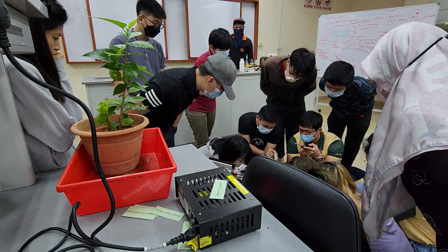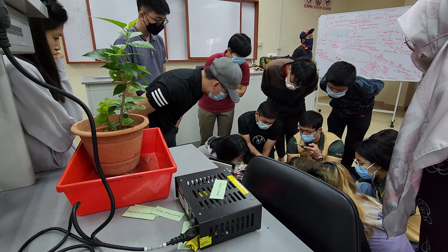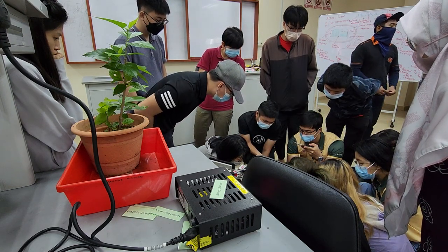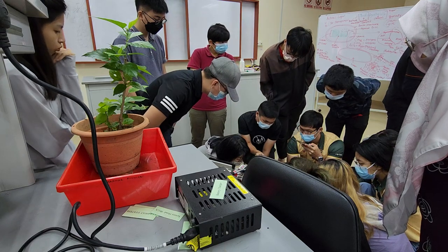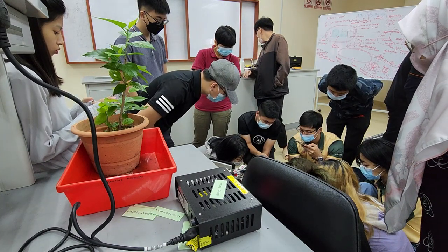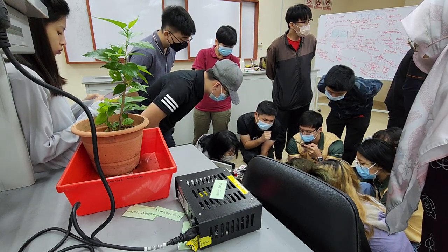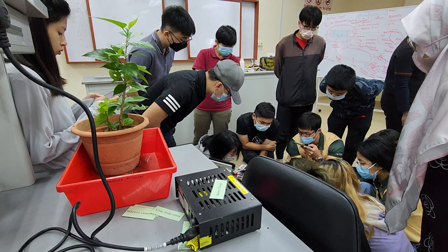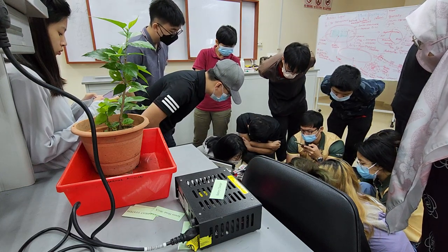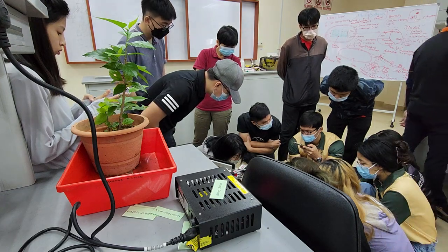Okay, so you need to adjust. Bypass, bypass. Then slowly tighten up. Now? No, not yet. Betul ke belum? Boleh nampak kan? Belum.